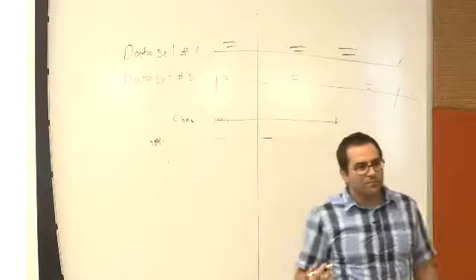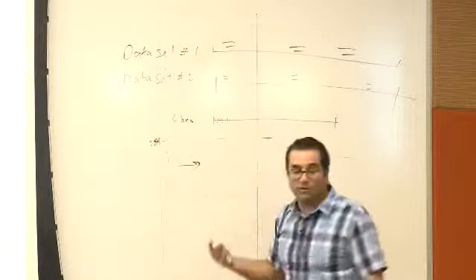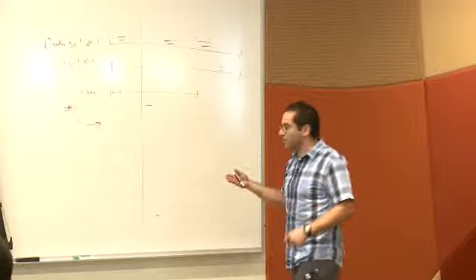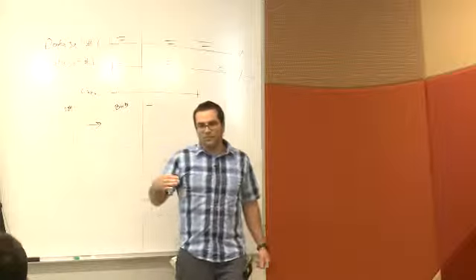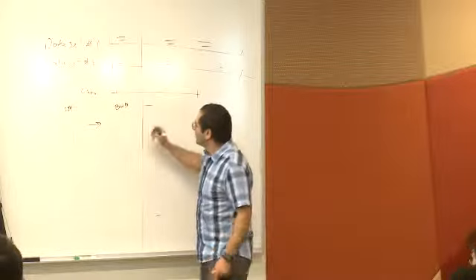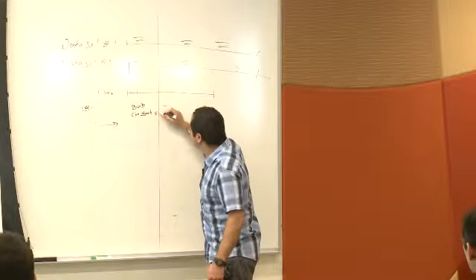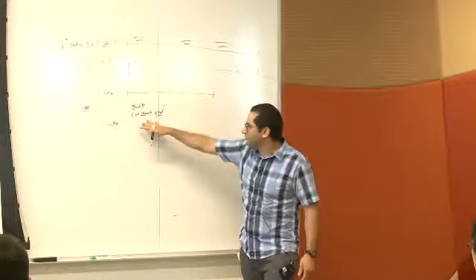And then the next step will be to take these bin files and take a genomic area of interest. In the example that I've sent you, it was what we call promoters, which are the areas around the transcription start site. And we call it a bed file. The bed is usually going to tell the script which chromosome you're interested in, so it's going to be chromosome, and then the start position and the end position. It can have more features, but these are the ones that we care about for now.